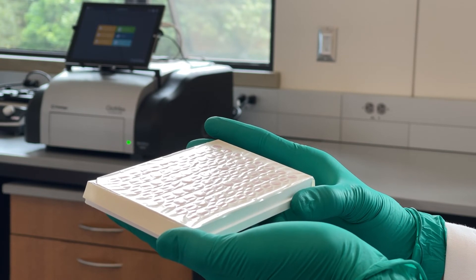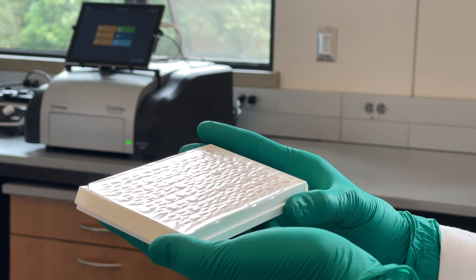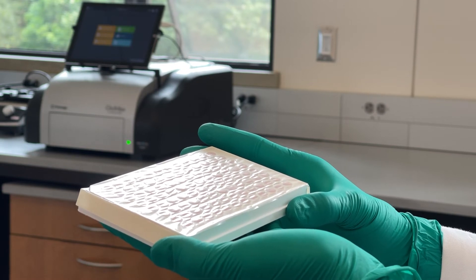When performing multi-day assays, evaporation is always a consideration. Here, I'm using a gas permeable membrane on the plate, which allows for consistent evaporation across the plate and lets me use all of the wells, rather than only the inner 60.